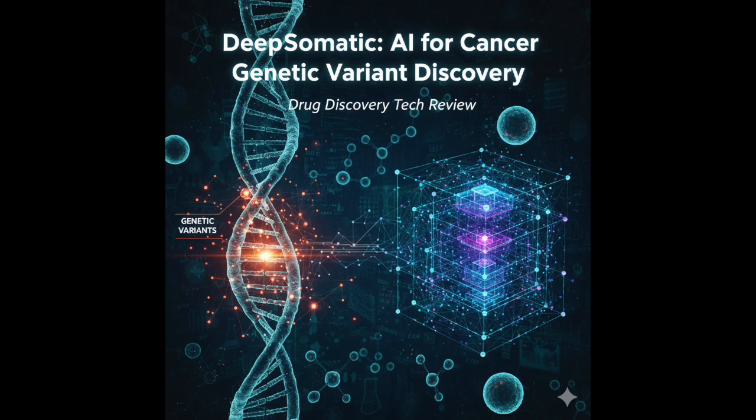So the data revolution enabled the algorithmic potential. Absolutely. Castle provided the ground truth needed for the CNN to learn robustly, especially for those previously intractable indel calls. It proved that diverse, high-quality, multi-technology data was the key to unlocking the next level of accuracy. So, armed with the Castle dataset, DeepSomatic didn't just improve on previous benchmarks, it significantly outperformed the existing state-of-the-art tools. We're talking about established callers like Strelka2, Mutect2, Somatic Sniper, and the more recent deep learning contender, ClairS.